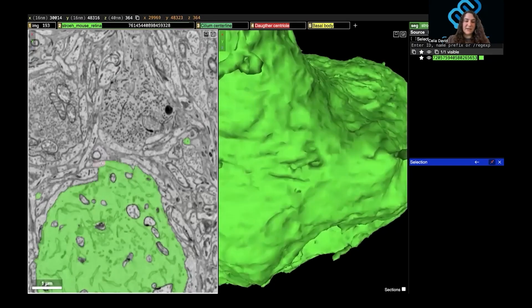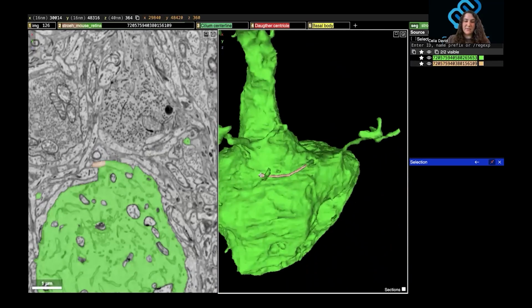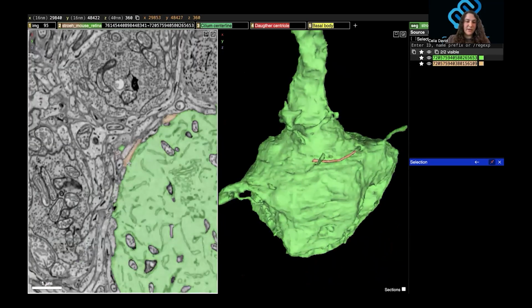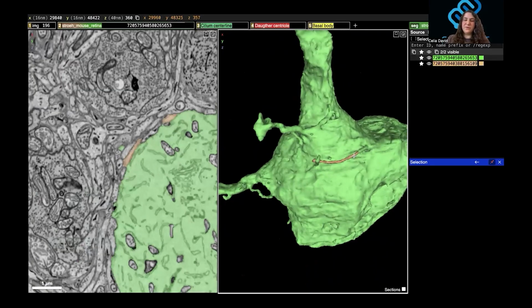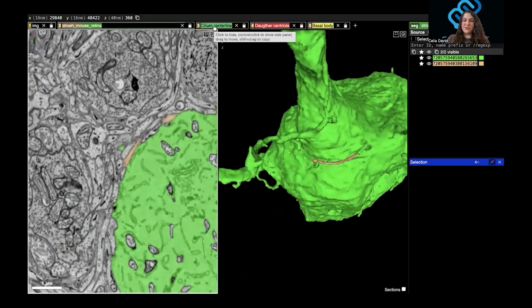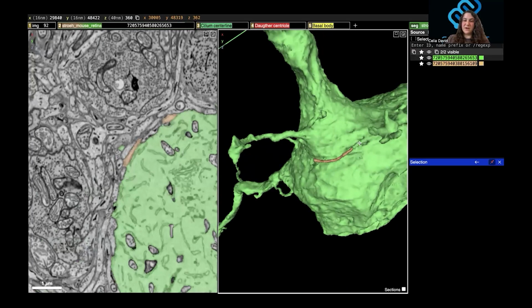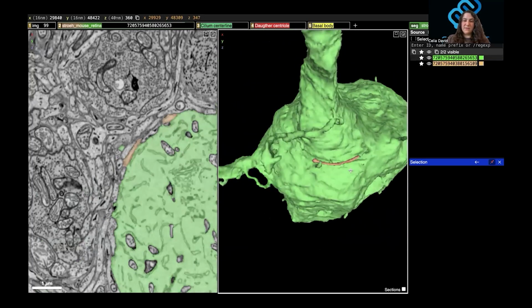And then this one has an incomplete one. So I'm going to click it, and you can see it added part of it here. And then I'm going to just keep going and see if there's any more to add, and there's not on this one. So for these, you can choose to keep in this secondary segment or not, but when you're annotating the cilium center line, make sure it goes through that whole structure and doesn't just stop at the place where there was a break here. So that's the second example.